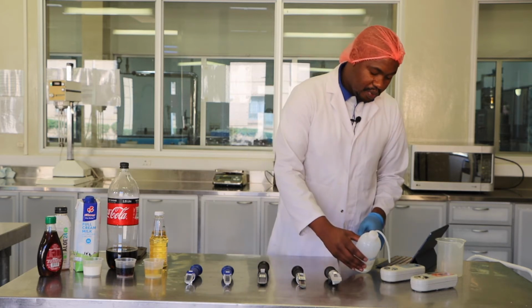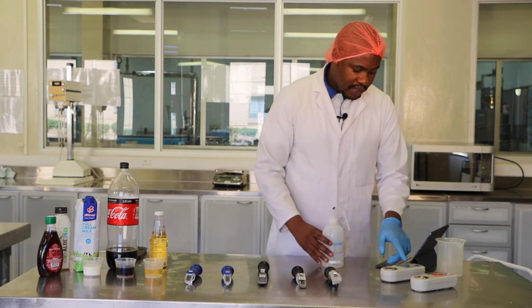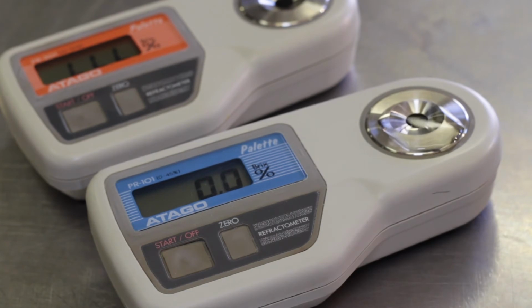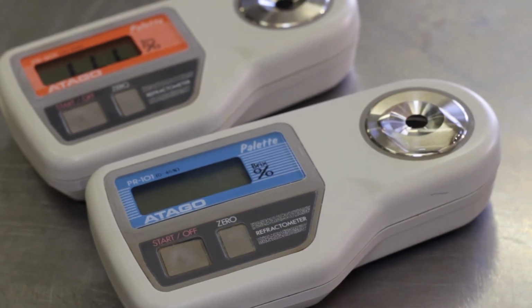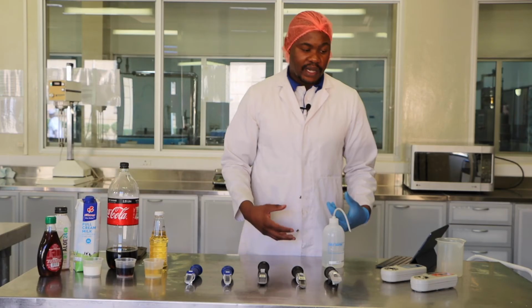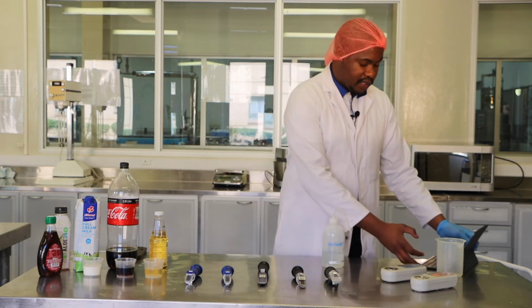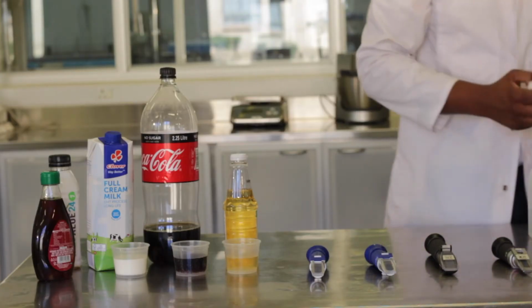So I can just put in a few drops, not a lot, of distilled water, and then you say 0, and then you say start. And then it should give you a reading of 0, 0. When you see a reading of 0, 0, then you know that the refractometer is measuring the correct scale. So now I'm going to do this part.